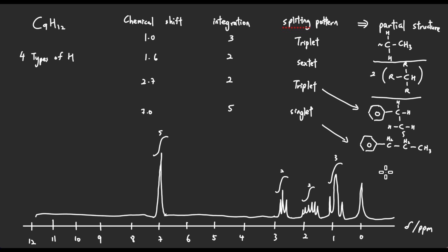Alright. Now you may wonder why or how come this structure exists. That means we actually got a wrong answer, because this benzene ring, particularly this carbon, is going to be deshielding, because this benzylic carbon is sp2 hybridized, and sp2 hybridized is more electronegative than the sp3, which is the neighboring carbon.